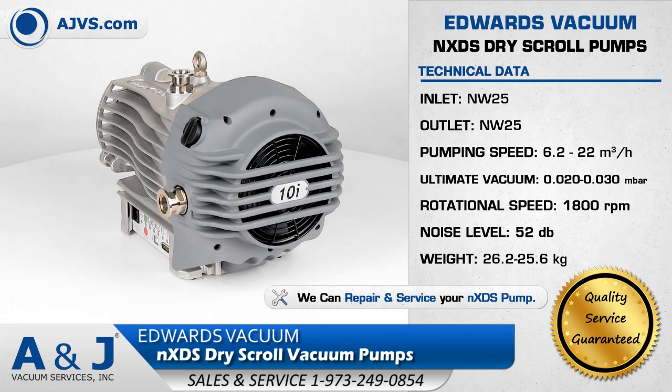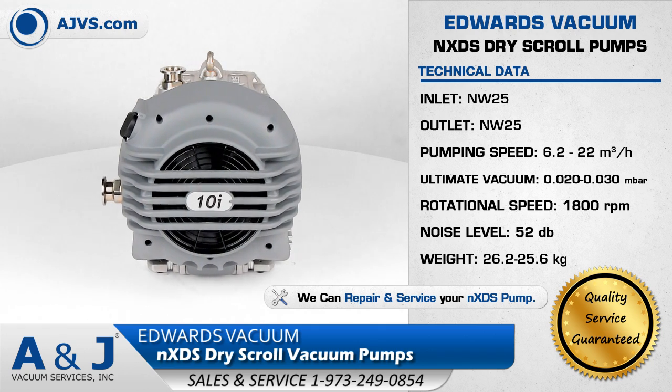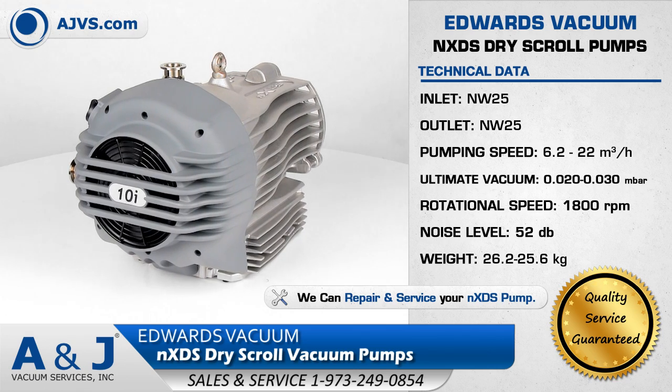The NXDS combines the latest advances in scroll technology with an intelligent inverter drive coupled with a hermetically sealed mechanism for a lubricant-free vacuum environment.